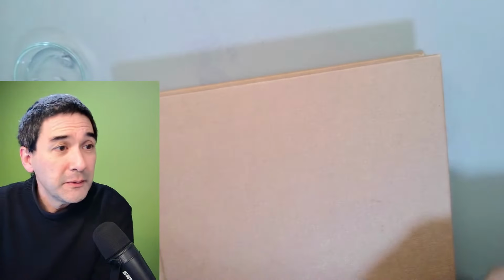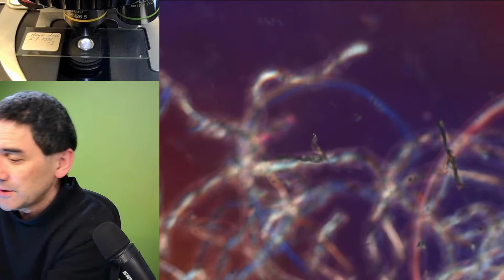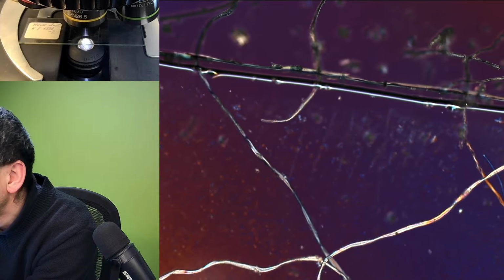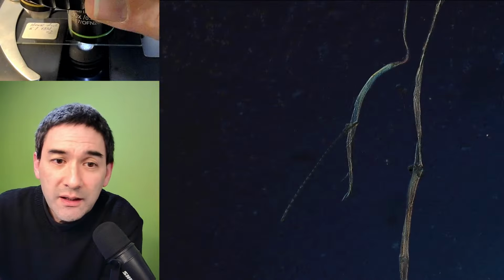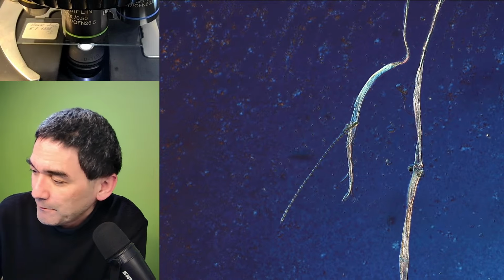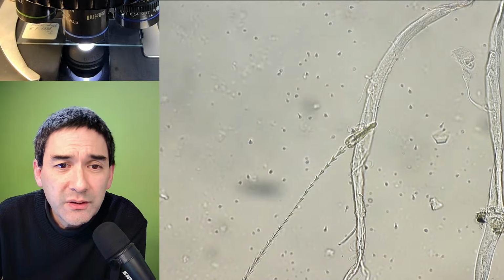Let me quickly have a look. Where is the scope? Microscope. So that's the house dust again. Just a second. I don't quite remember exactly where it was. I found it. Are you able to see it? So this is a nice permanent slide that I made. Here it is. This is now in DIC again. Let's go higher yet. You know what? I'm going to take this out here. Here we go.